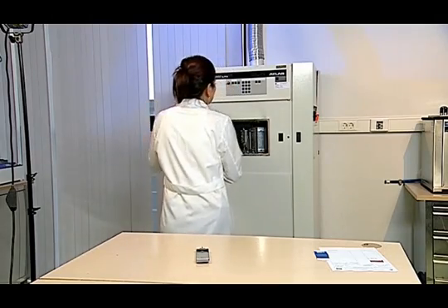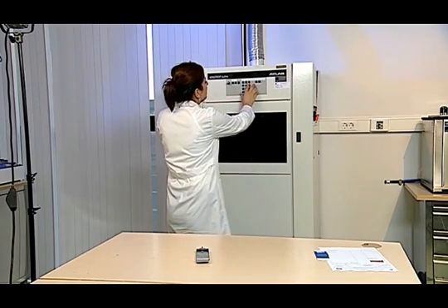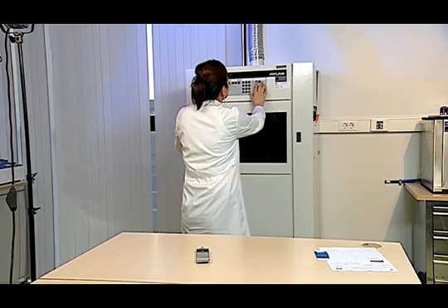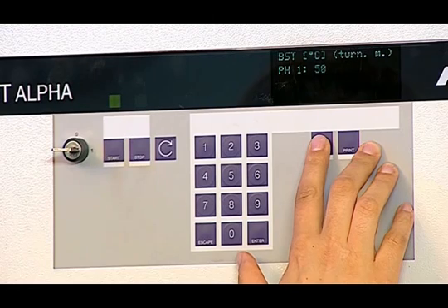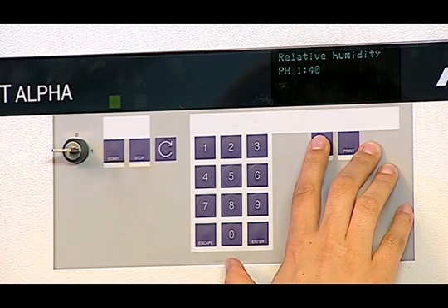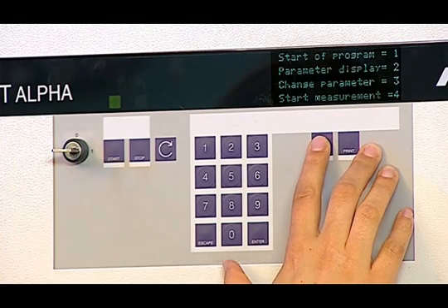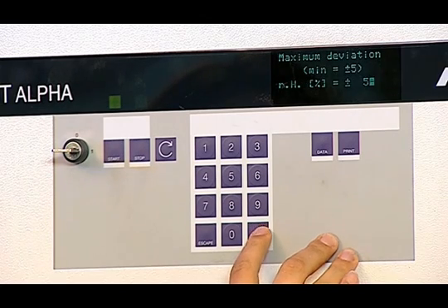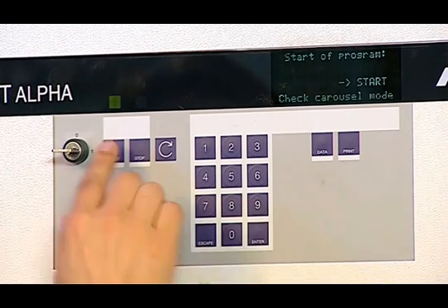In this method, we have the opportunity to test more than one sample together. We check the parameters that we have set: the temperature must not exceed 50 degrees Celsius, humidity is set to 40%, there will be no sprinkling, and the energy is taken to be 42 for the best control filter. The start button is pressed after setting the total time period, and the test is started after checking the tolerances.